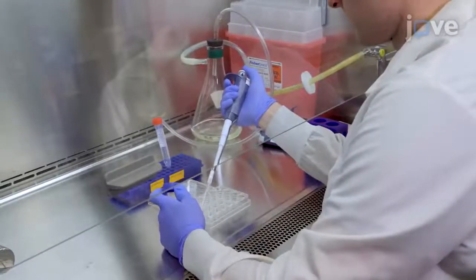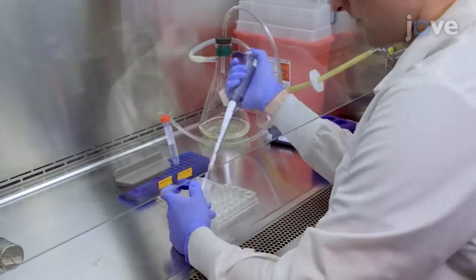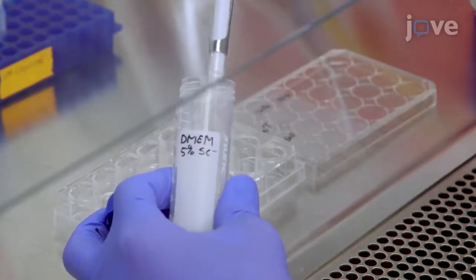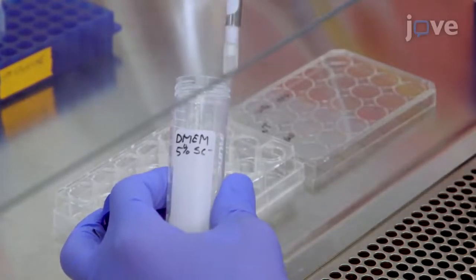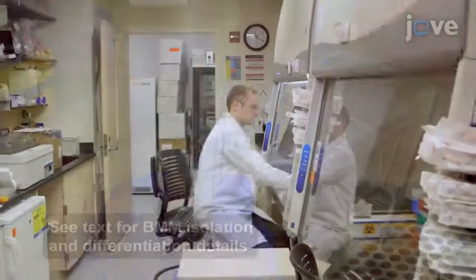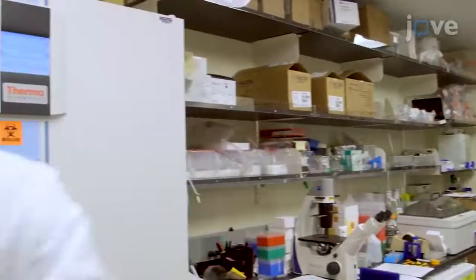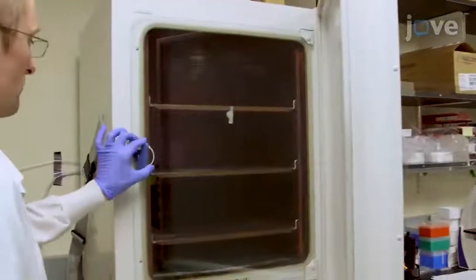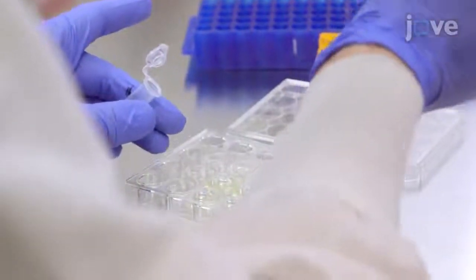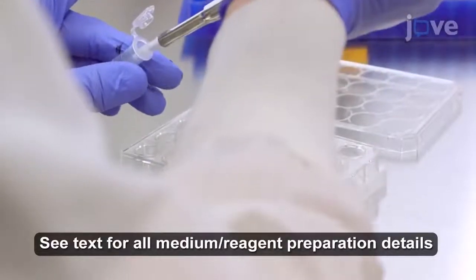Begin by replacing the medium from LPS-primed bone marrow-derived macrophages seeded on glass cover slips with 290 microliters of DMEM5 medium supplemented with 5 micromolar nigericin and 5 millimolar glycine per well. Return the 24-well plate to the cell culture incubator for 60 minutes at 37 degrees Celsius and 5% carbon dioxide, adding 10 microliters of 30x FAM-YVAD-FMK after the first 15 minutes.